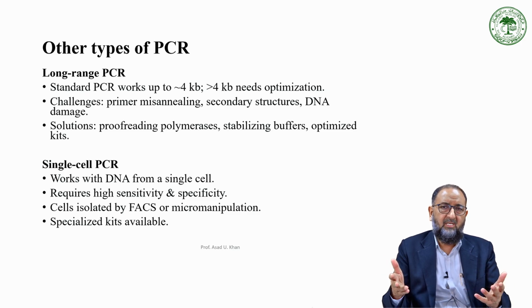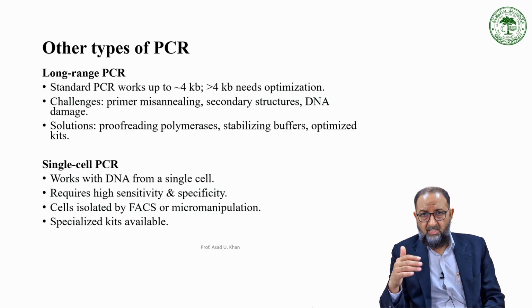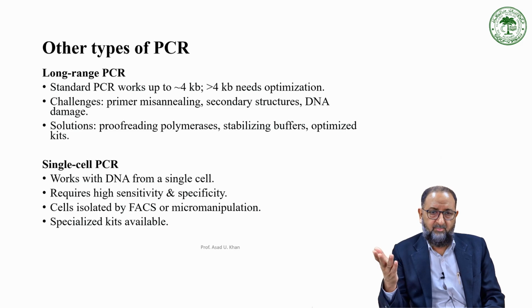You can have DNA from some viruses and so on. So there is always a chance of nucleotide bases being incorporated into the reaction mixture, where non-specific binding of the primers randomly takes place, and that reduces the sensitivity and specificity in getting the product.